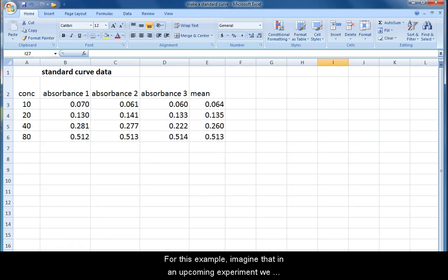For this example, imagine that in an upcoming experiment we will be measuring the changes in substance A's concentration using a spectrophotometer and we will use the absorbance to calculate the actual concentration. To do this we need to first create a standard curve that relates known concentrations of A to the amount of light absorbed by A.